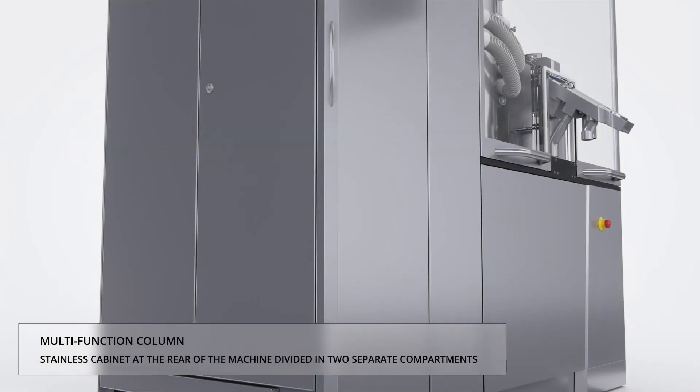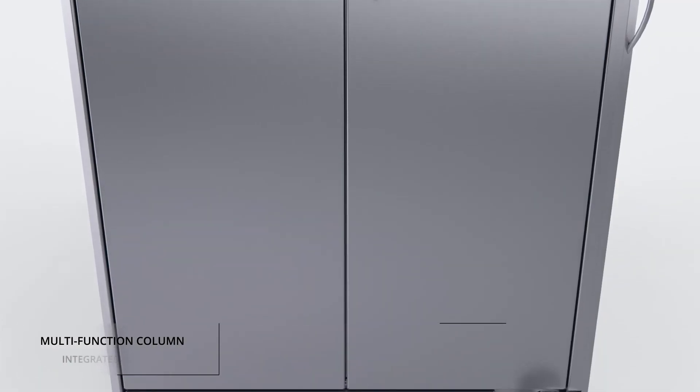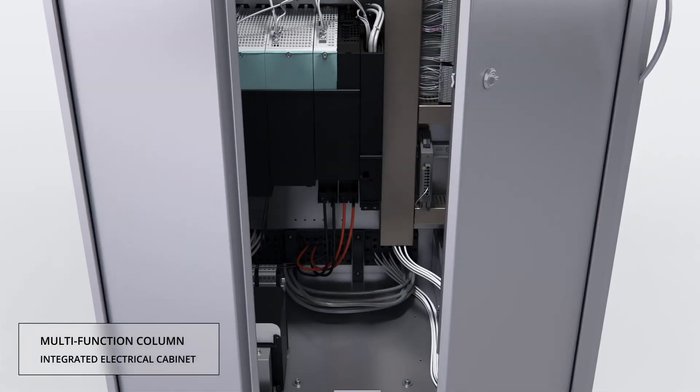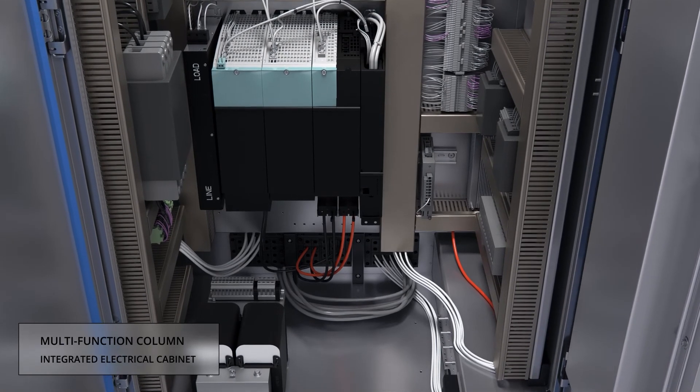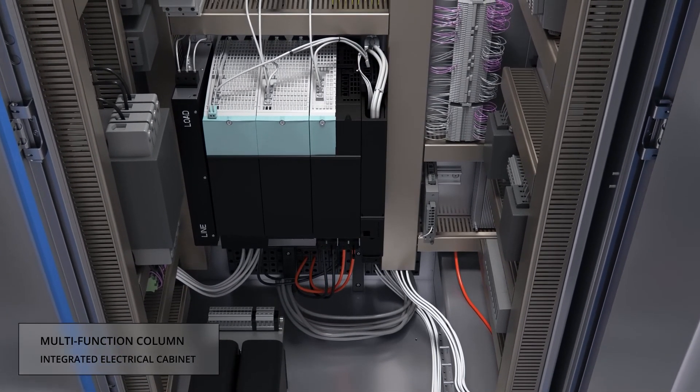The integrated control cabinet avoids additional space and cabling in the room. The water-cooled torque drive and multi-function column permit a completely sealed machine exterior and eliminate heat transfer to the compression zone and to the room.